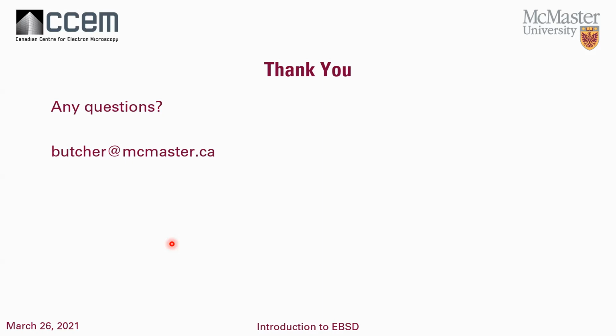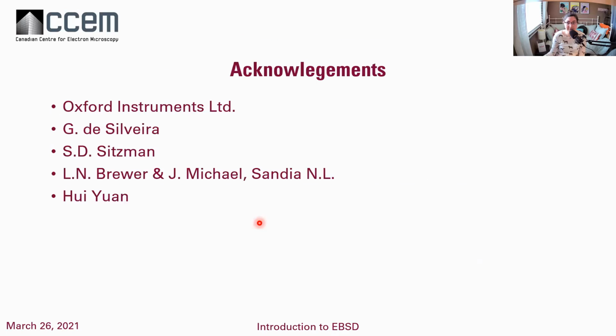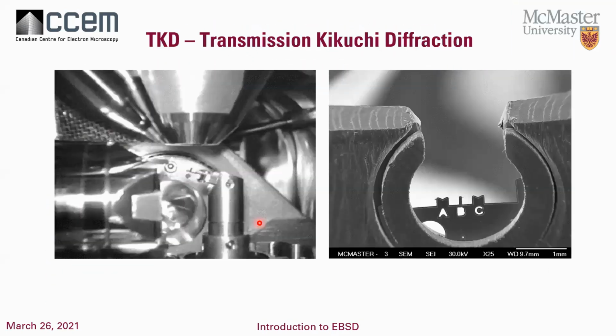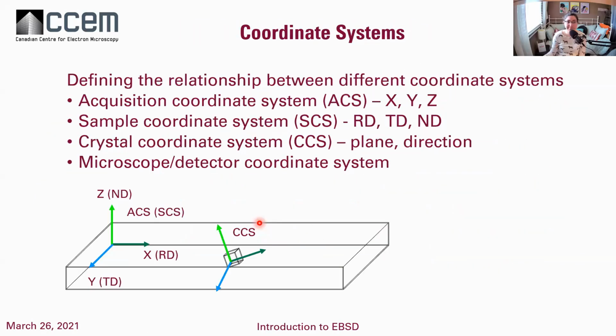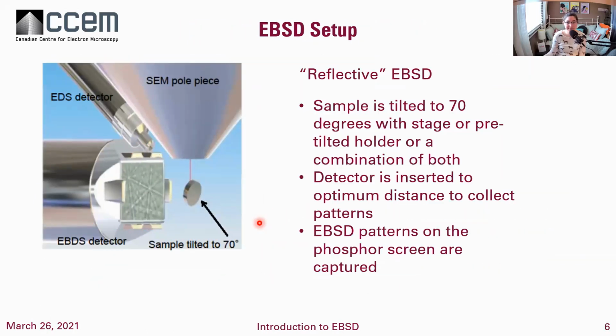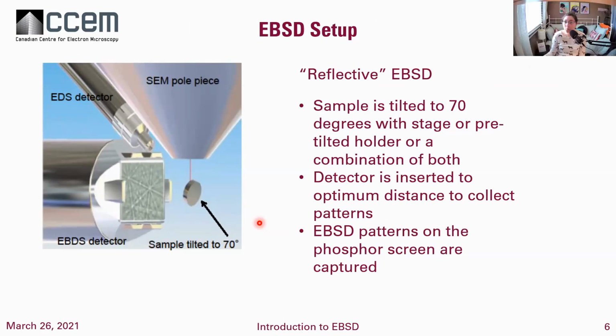Another question. On slide 6, where is the position of the camera which sees and collects the live image of the Kikuchi lines on the detector? Oh, okay.